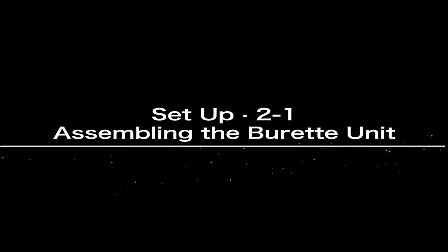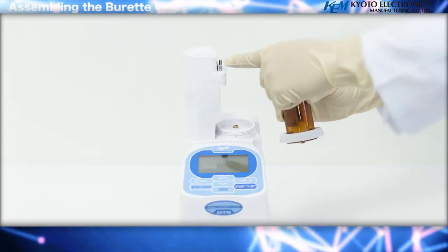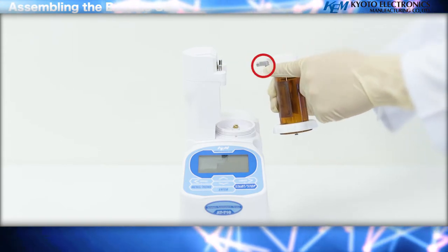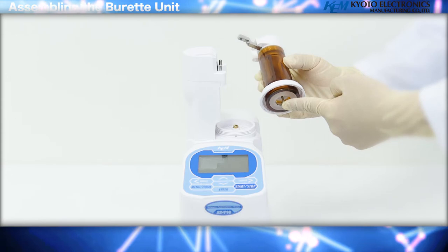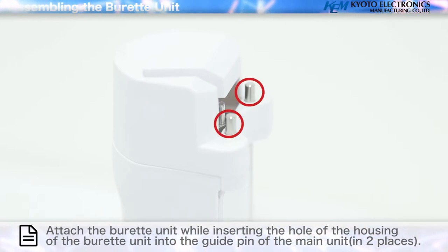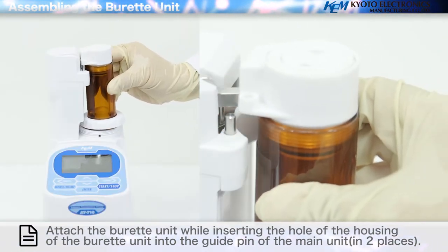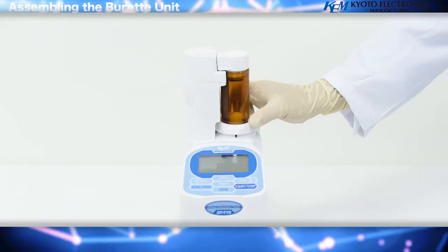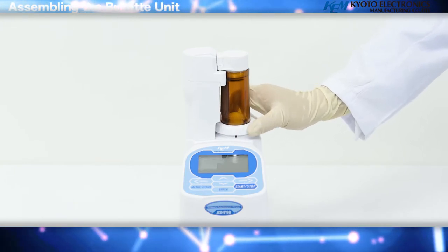Assembling the Burette Unit: slide the Burette Unit from the right and hook the piston pushrod of the Burette Unit to the drive screw of the main unit. If you put the housing on the guide pin of the main unit and slide it, it will be easier to adjust its vertical position. Attach the Burette Unit while inserting the hole of the housing into the guide pin of the main unit in two places, then tighten the retention screw to affix the Burette Unit in place.